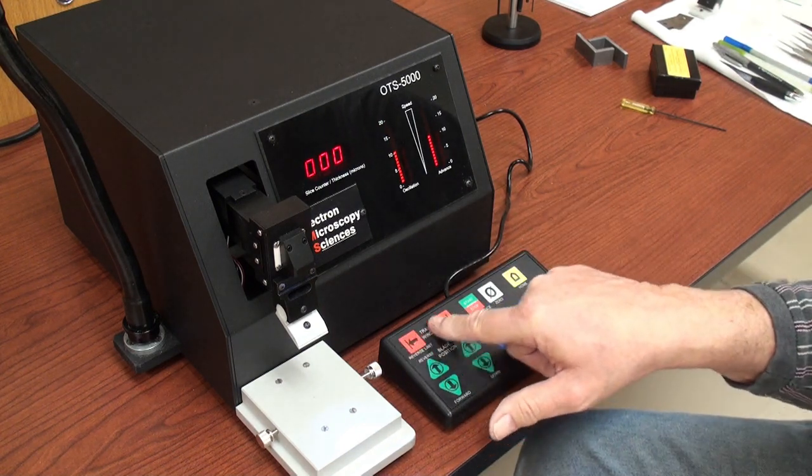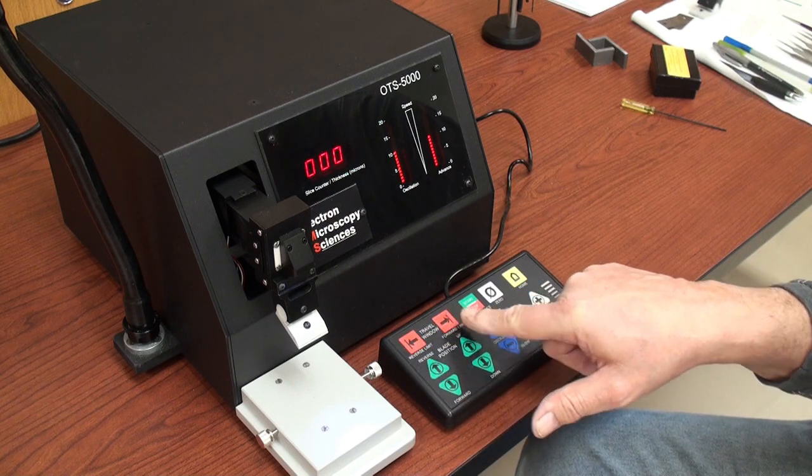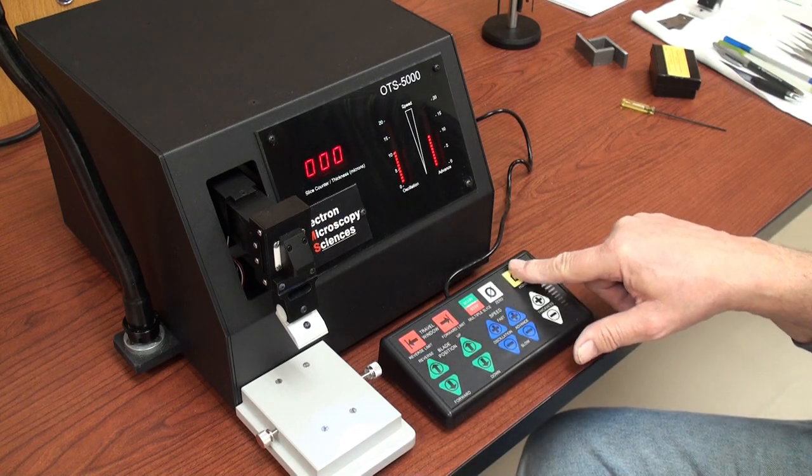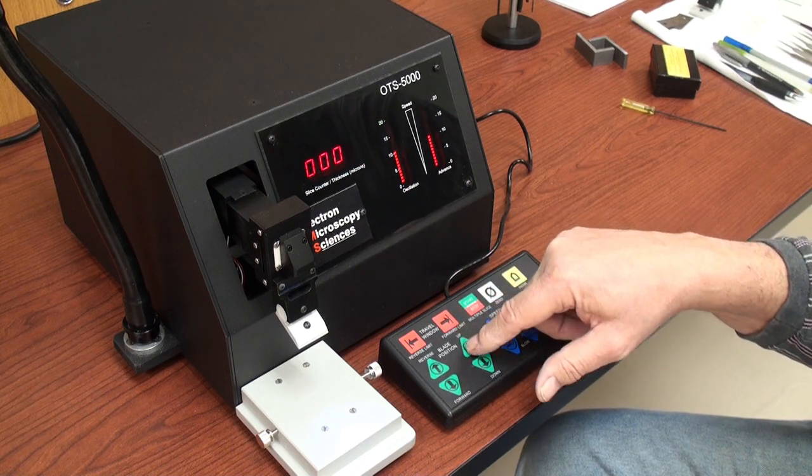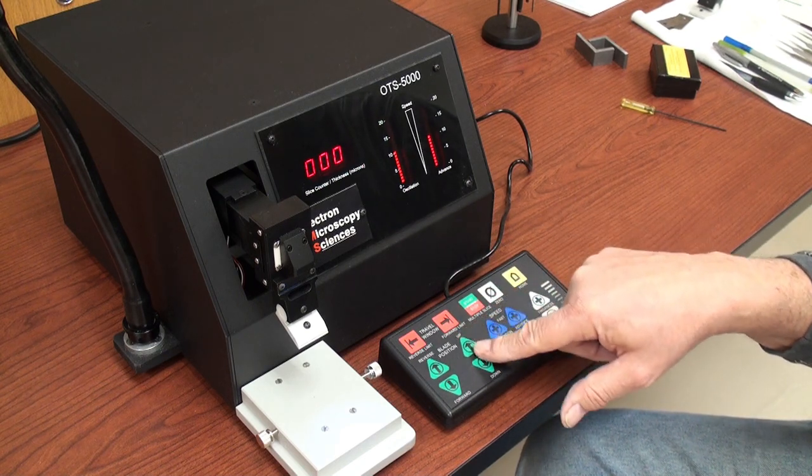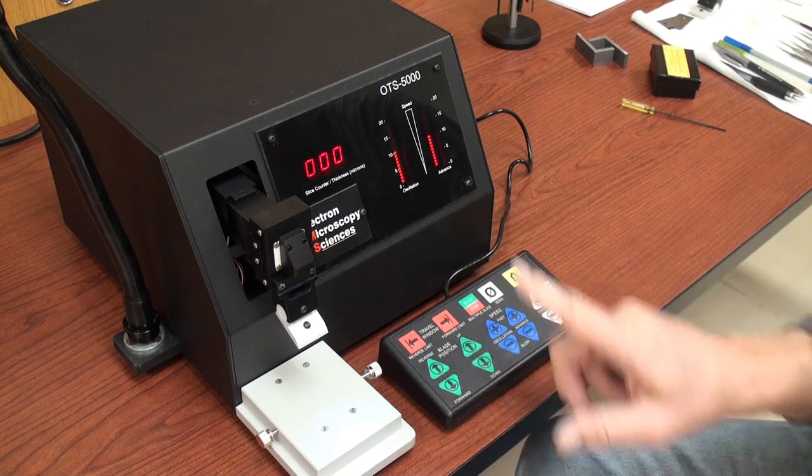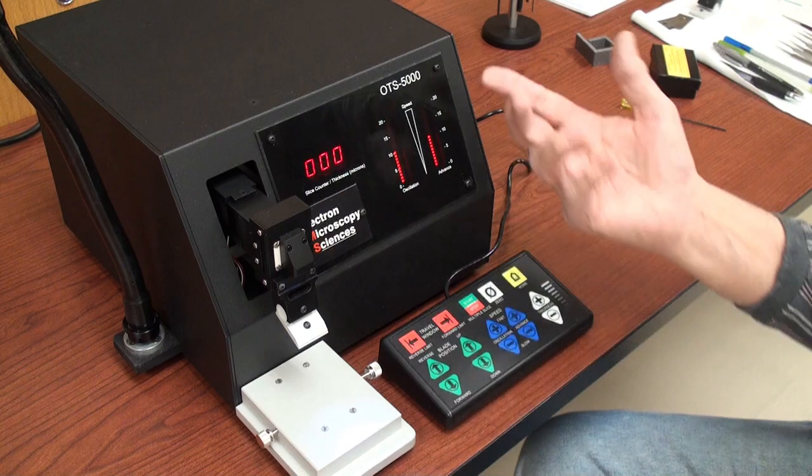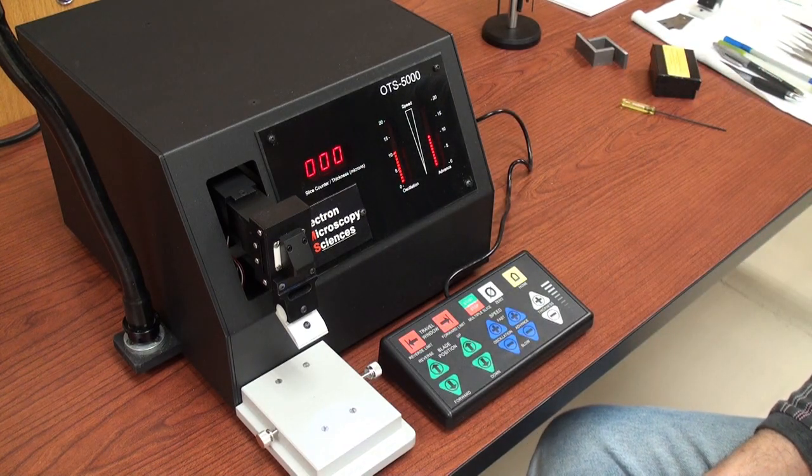The 4500 model does not allow you to set cutting windows. Nor does the home button work. So you would have to manually advance or retract the blade position. Raise it up. Raise it all the way to reverse when you're done sectioning for that amount of time.